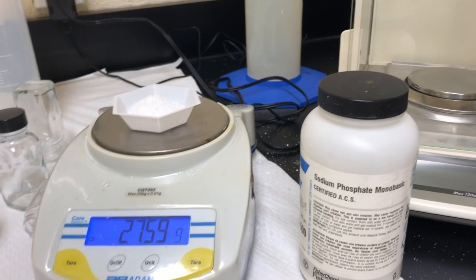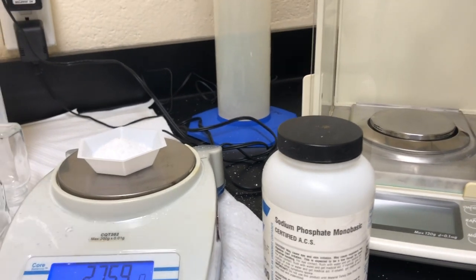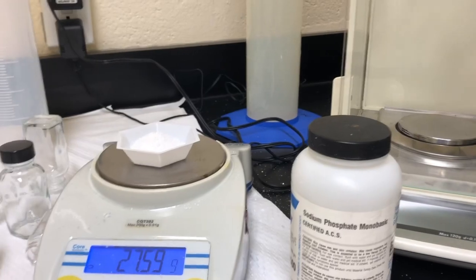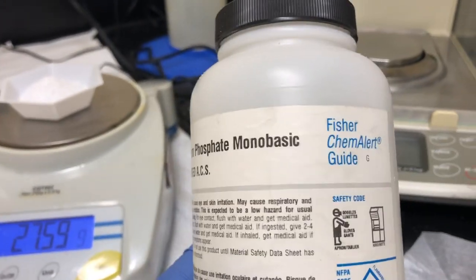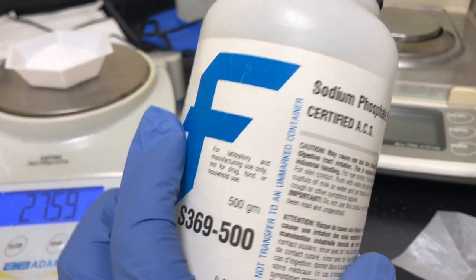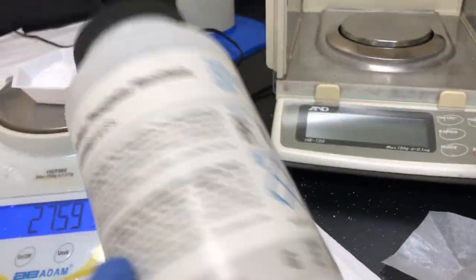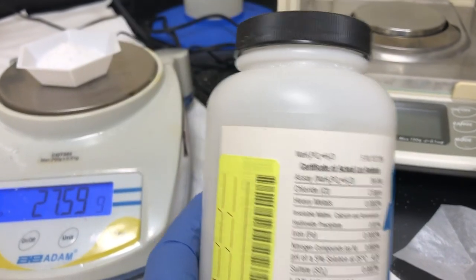Hello everyone, so today we're going to be making sodium phosphate monobasic. What you want to do is grab your materials. So as you see here, sodium phosphate monobasic, the molecular weight can be found on the side.